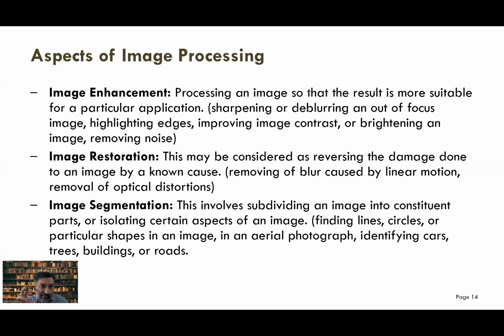Now you need to identify where exactly that is in your image, and you want to extract it and then quantify its properties. So usually we do these three things, and today we're going to look a little bit at all of these, and especially we'll do a practice on image segmentation.